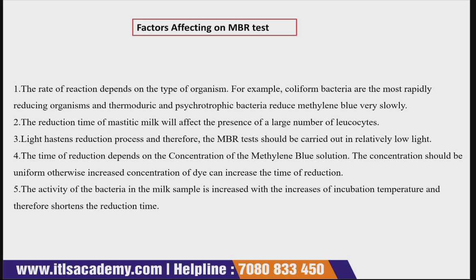Second is the reduction time of mastitic milk, which is affected by the presence of a large number of leukocytes. Third, light accelerates reduction processes, and therefore the MBR test should be carried out in relatively low light.